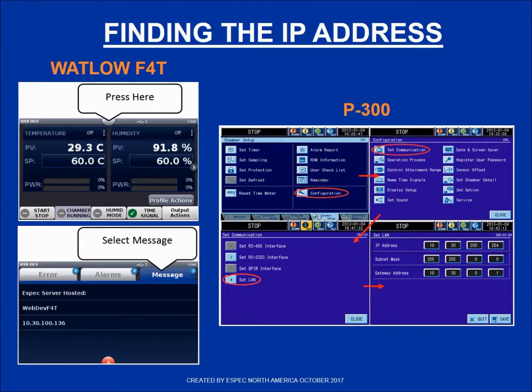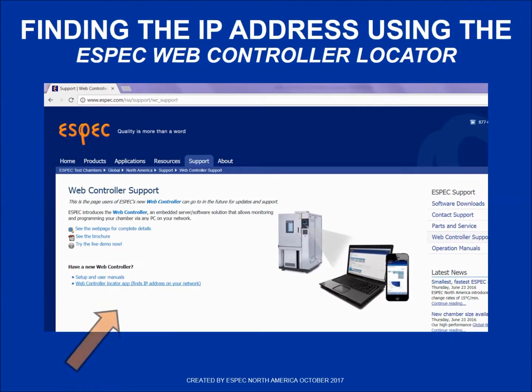You can find the IP address by clicking through the on-screen menus on your chamber controller screen, as shown for either your Wattlow or your P300 controller. You can also use the ESPEC web controller locator to find the IP address, and that can be downloaded directly from ESPEC.com and installed onto your computer.